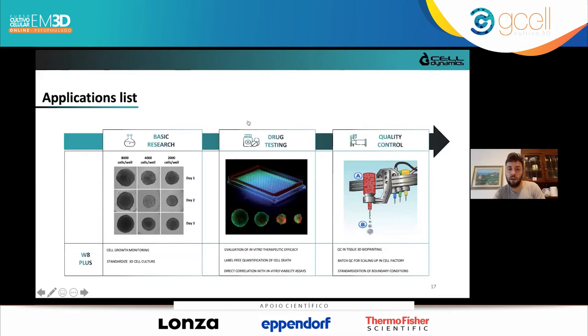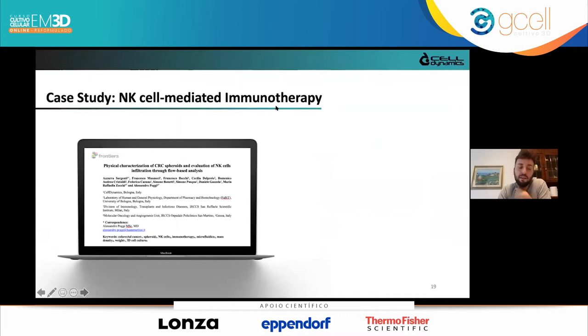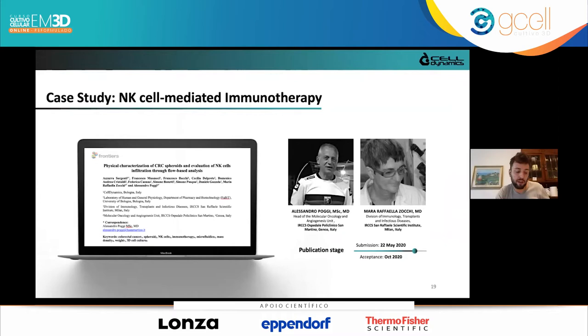Okay, so now I have a couple of case studies to showcase what we have already collected as biological results with our technologies. The first one regards NK cell-mediated immunotherapy, and it is the result of our collaborations with a couple of immunologists here in Italy. We have evaluated the efficacy of this treatment approach in colorectal cancer spheroids from the physical point of view.